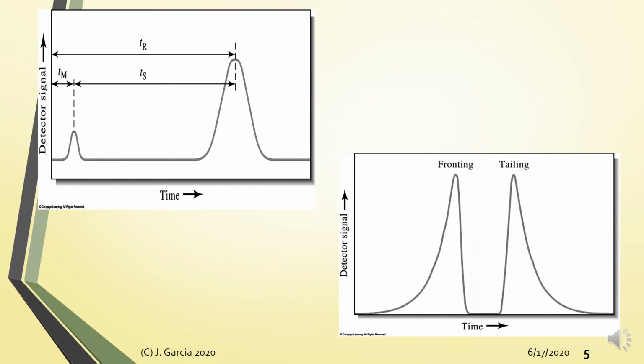Okay, so next we have some terminologies, no, regarding your chromatogram. All right. So for instrumental liquid chromatography, HPLC, normally the chromatogram is represented with the x-axis referring to the retention time. Okay.